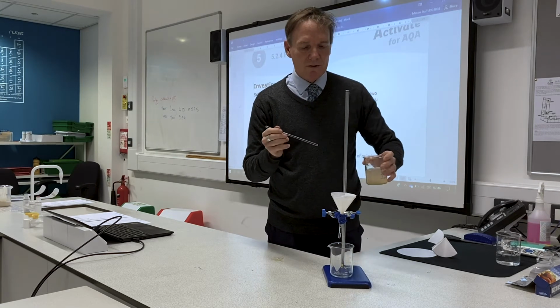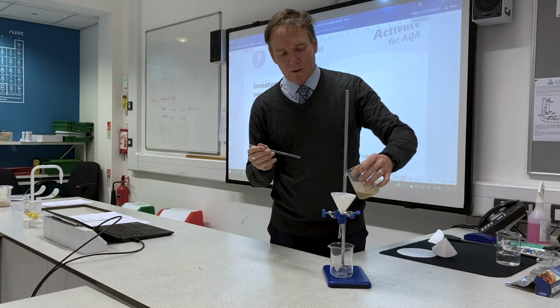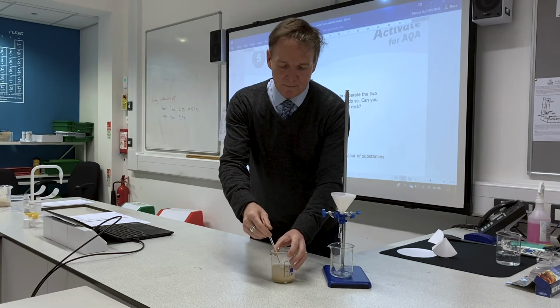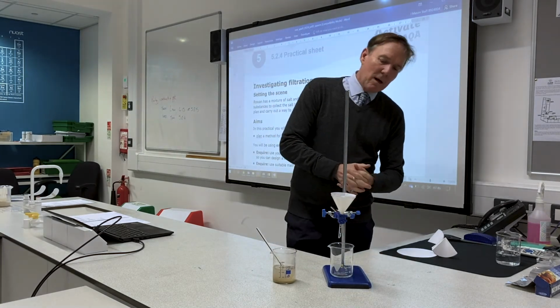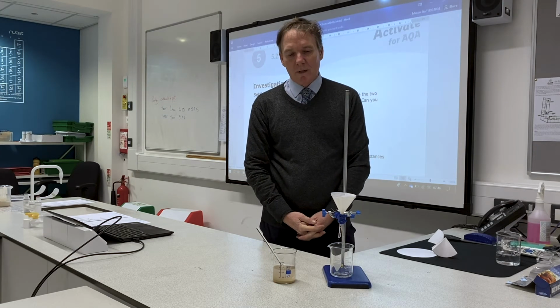You've poured it into the wrong bit, or there's a hole in your filter, too big a hole in the filter paper, and the sand isn't going through. All right, so now, as you can see, it goes through. It probably takes about 5-10 minutes to completely filter.